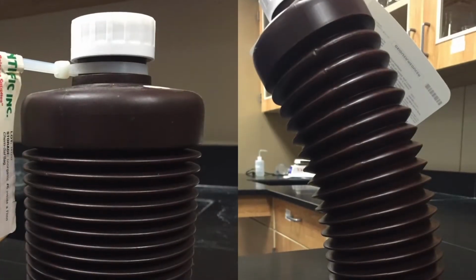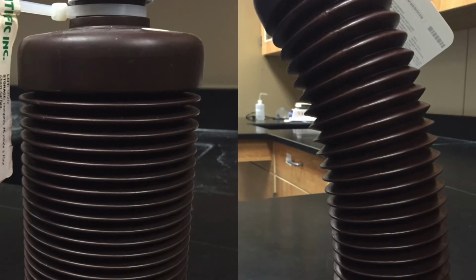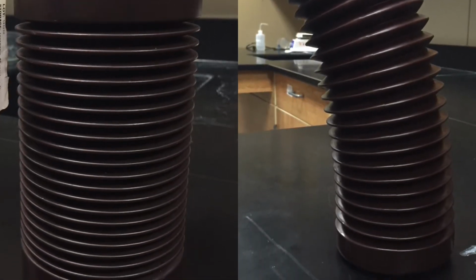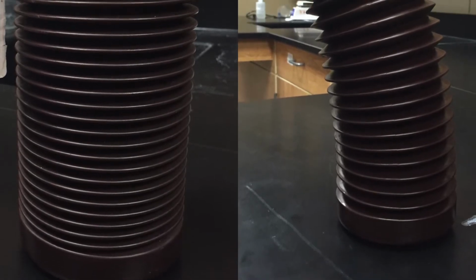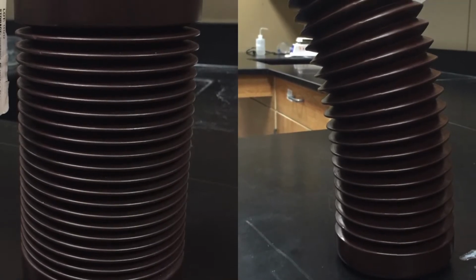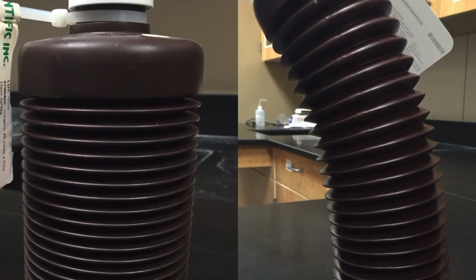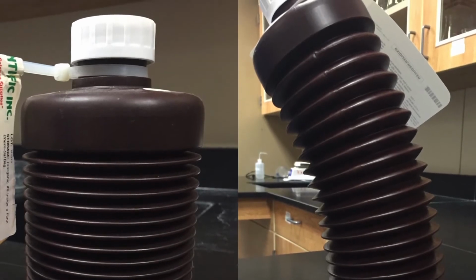This clip helps show the need for a catalyst. As you can see, the bottles are made with an accordion in the middle. This accordion is because the hydrogen peroxide slowly decomposes, releasing oxygen into the bottle. The bottle on the right was purchased a long time ago, resulting in the oxygen being released and the accordion stretching. The bottle on the left is newer and has not created enough oxygen to stretch the bottle. Our experiment with the catalyst will show the rapid decomposition of hydrogen peroxide, which will release the oxygen much quicker.